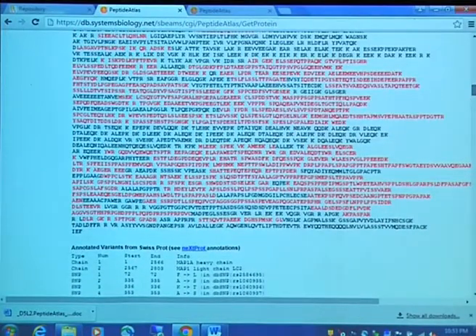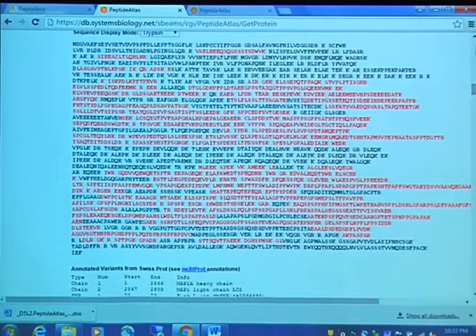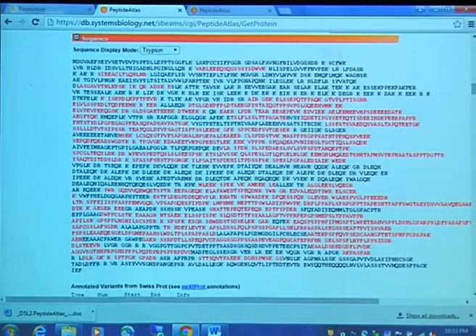And it's a long protein, so if you go down, can you scroll down to this view of the sequence? Do you notice how all the peptides are different lengths here? That's basically the tryptic view. What we've done is taken this protein and broken it up by spaces wherever there would be a tryptic digestion. And anyone that's used trypsin knows that if there's a P following a K or R, that is not a tryptic site. So those ones are not cut.